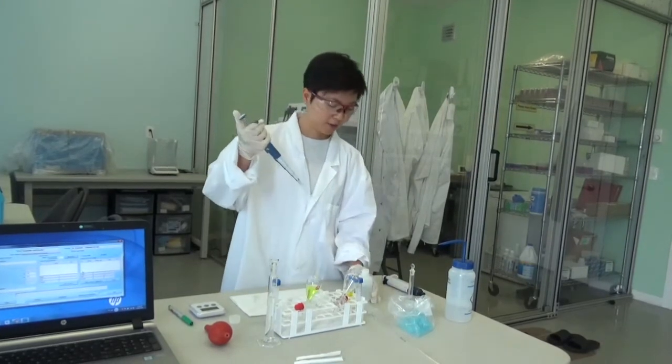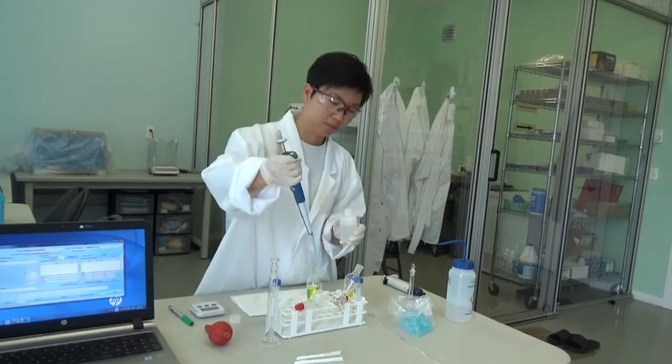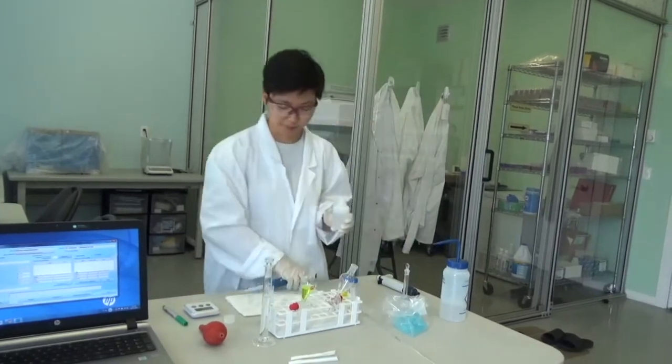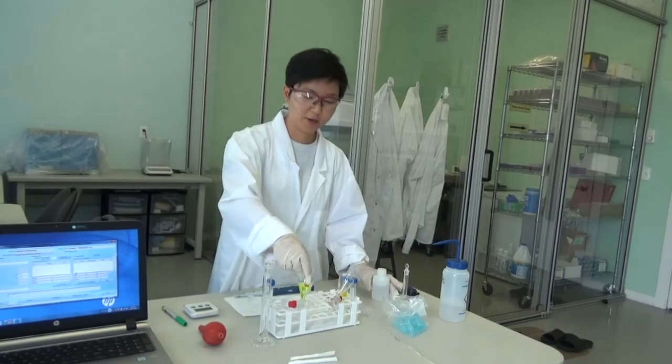The last to add is hydrochloric acid, 1 ml of hydrochloric acid. So this is the aqueous layer.